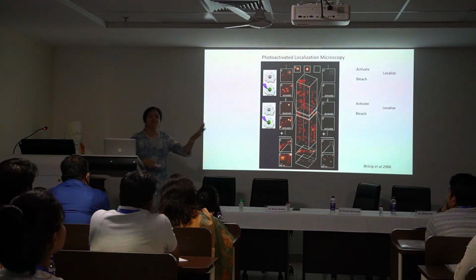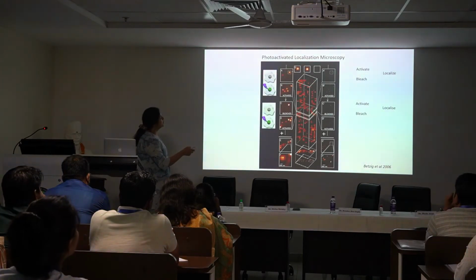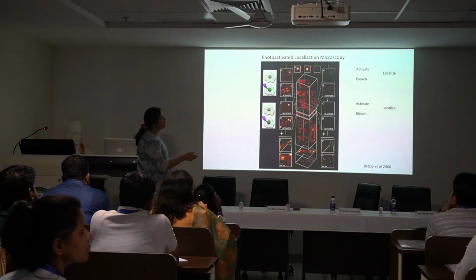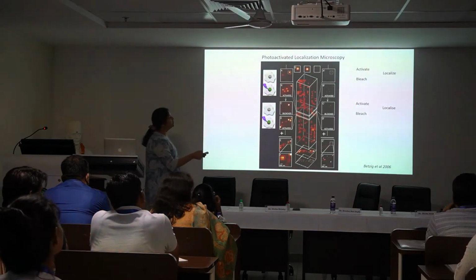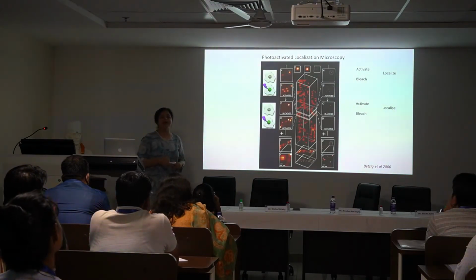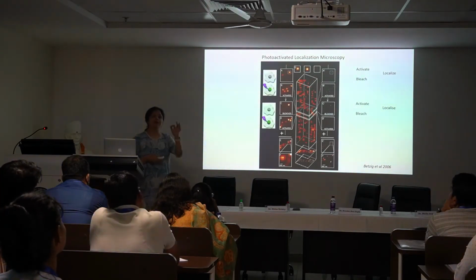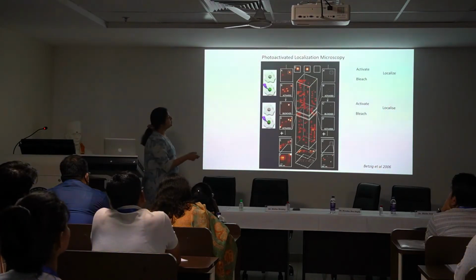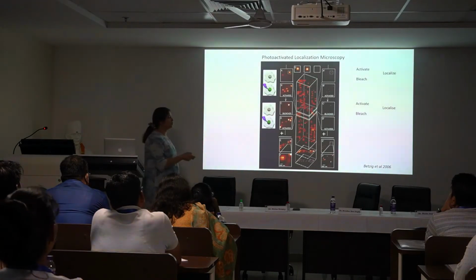It's to me somewhat easier to understand than the STED principle, because what you're doing is you are actually highlighting particles sequentially, okay? So you are highlighting them somehow. One can think of many different ways of highlighting them. One way is photoactivation. So maybe the tag could be photoactivated, and I'll give you one example of how photoactivation can be used beautifully in live imaging as well in the next few slides. But come back to its real use in super resolution.